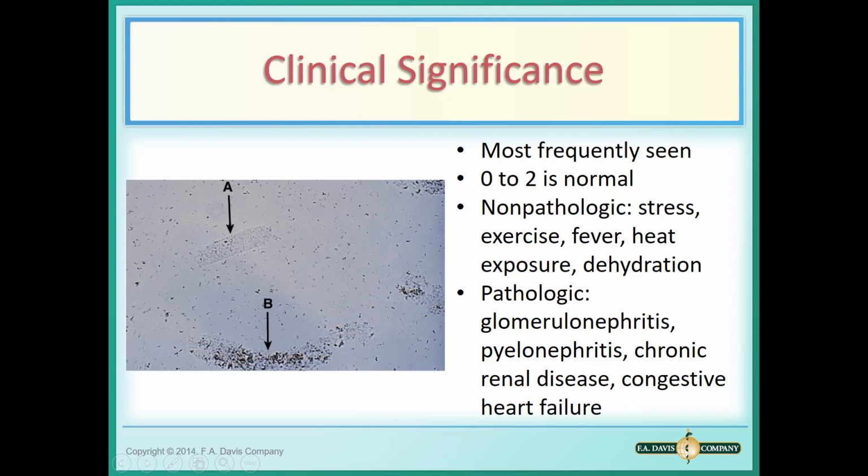This, I kind of wish they didn't put this in, but this is a picture trying to show you that this doesn't really have a protein matrix. And what this is, amorphous crystal that is laying on top of, this one's probably laying on top of a cast, but no, it's attached to mucus. I'm sorry, that's what I meant to say. This is actually a mucus thread that amorphous just gets trapped on.